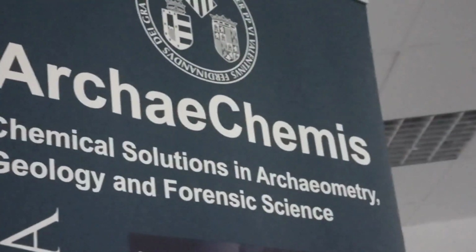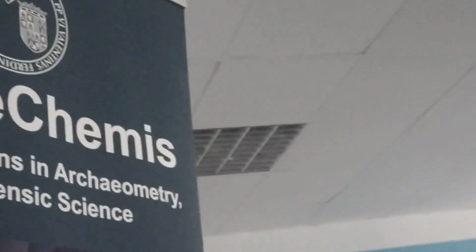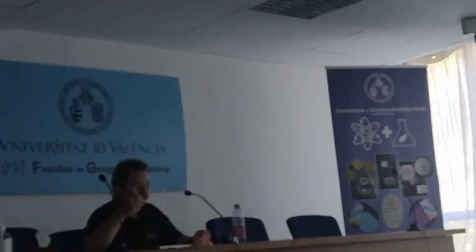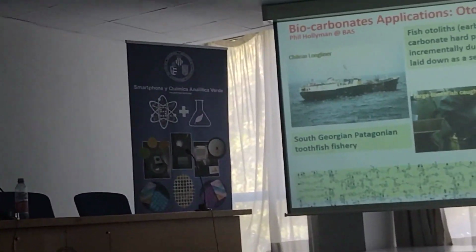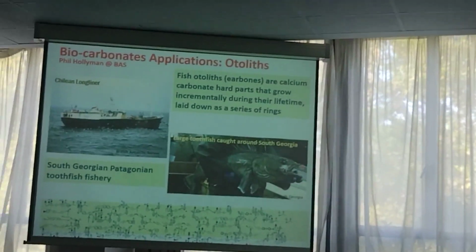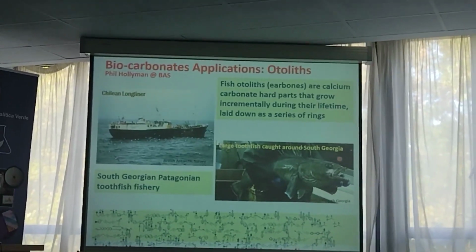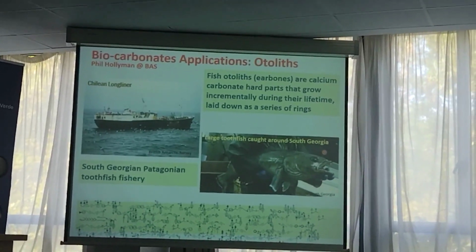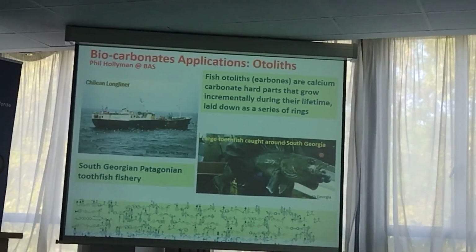I'm going to show you an example from modern ones because, as I say, I've not worked on archaeology. A colleague of mine, a former student, Phil Hollyman, is a marine biologist, and he now works for the British Antarctic Survey. They collect the ear bones from very large toothfish that are found in South Georgia, which is in the South Atlantic, nearly to the Antarctic.